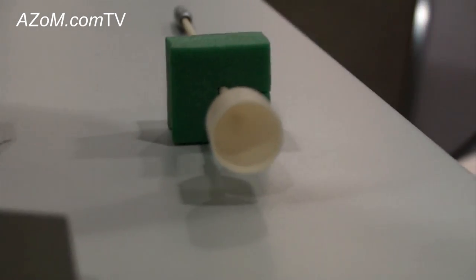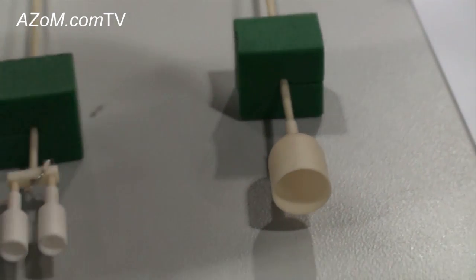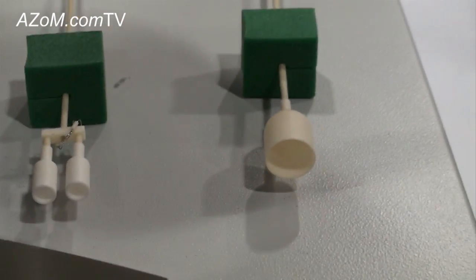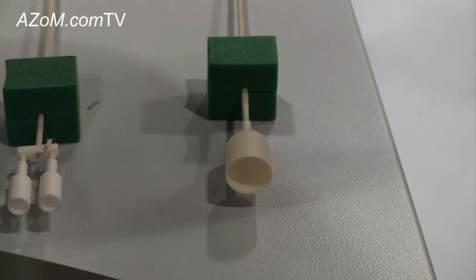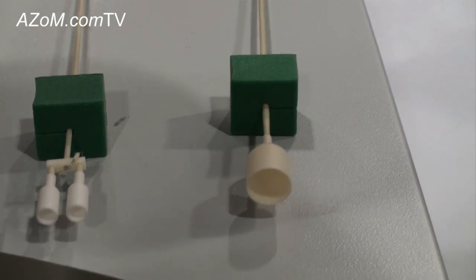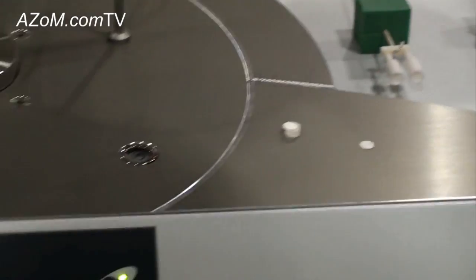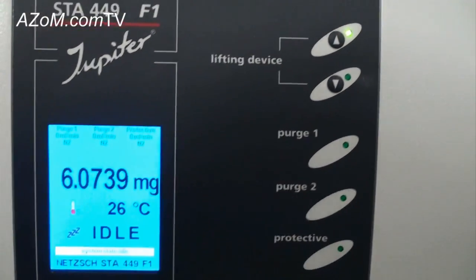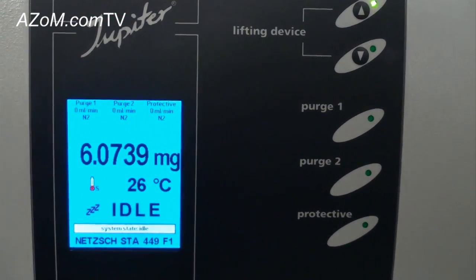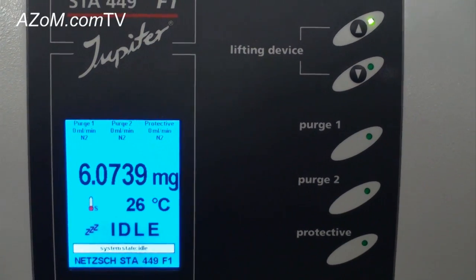The balance of the instrument can measure up to a 5-gram mass change, or on another instrument up to a 35-gram mass change. So we can measure very large masses and also at very high resolution. The resolution of this balance is 0.025 micrograms — which is 25 nanograms — making it a very, very sensitive balance.